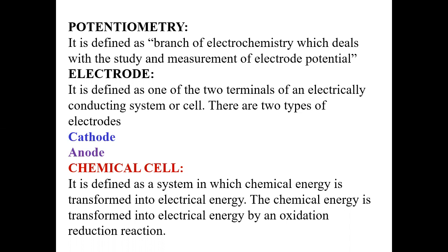What do you mean by current? Current is produced due to oxidation reduction. Maximum current means complete oxidation reduction. Current is studied by varying the voltage. At a certain potential at which maximum current is observed, we have to find that potential.